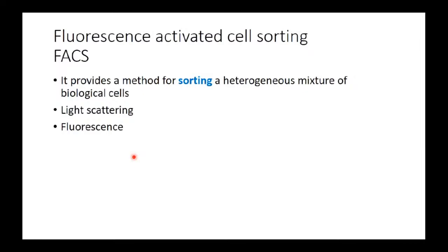FACS mechanism is not only a cell counting mechanism, but it's also a cell sorting mechanism. So it provides a method to sort a heterogeneous mixture of biological cells.